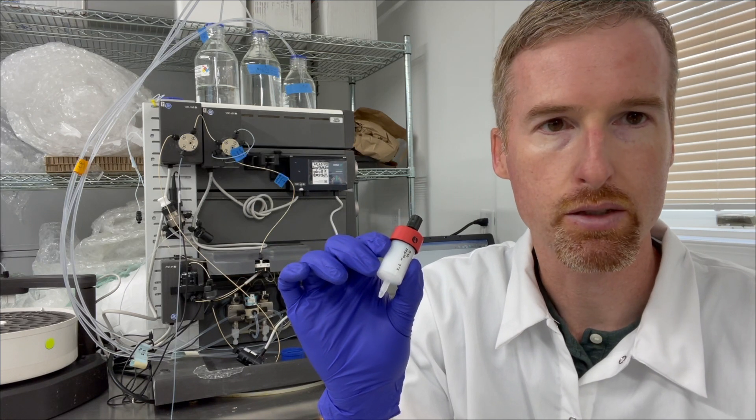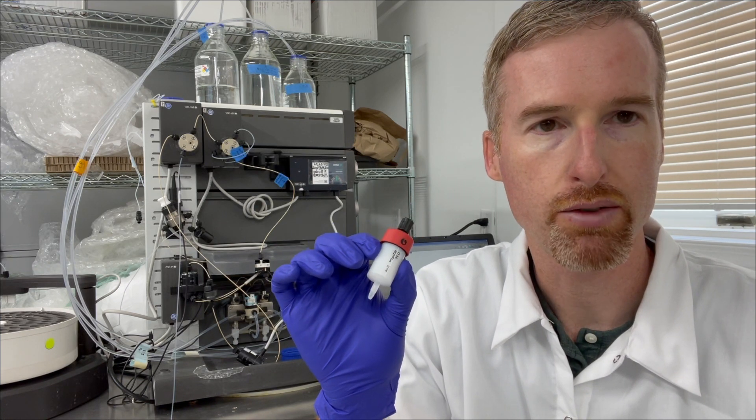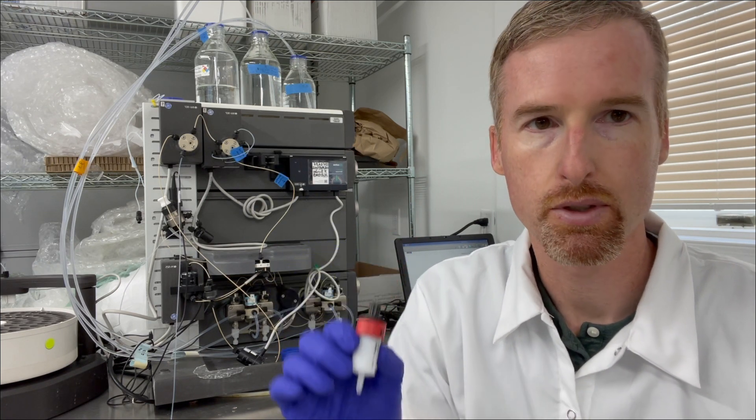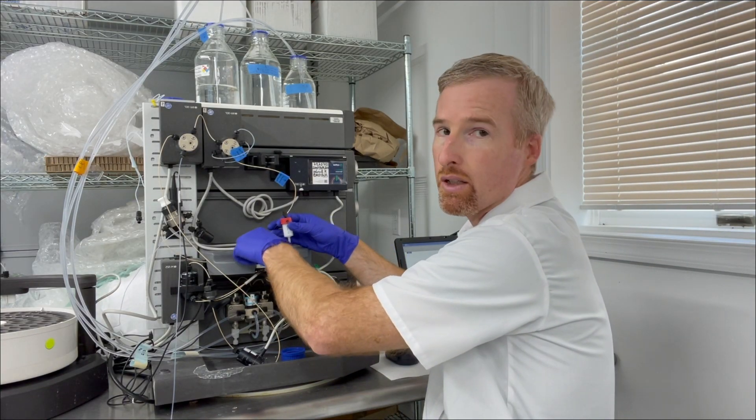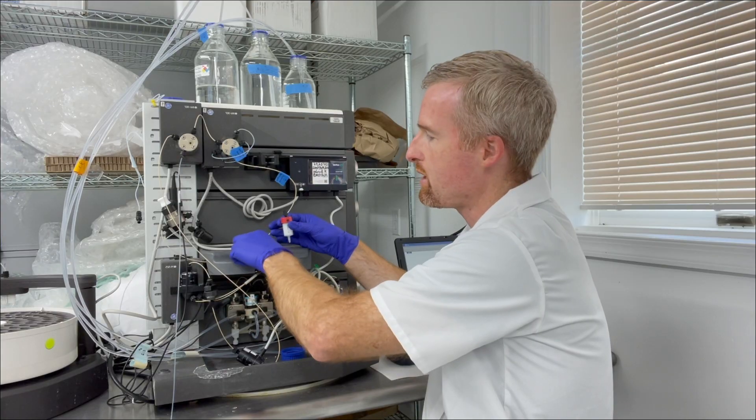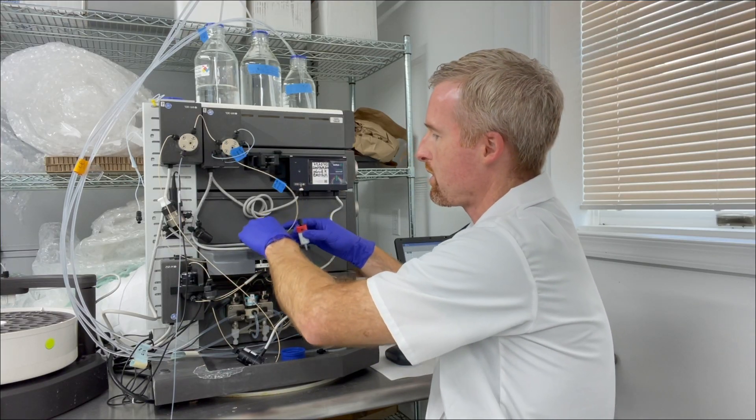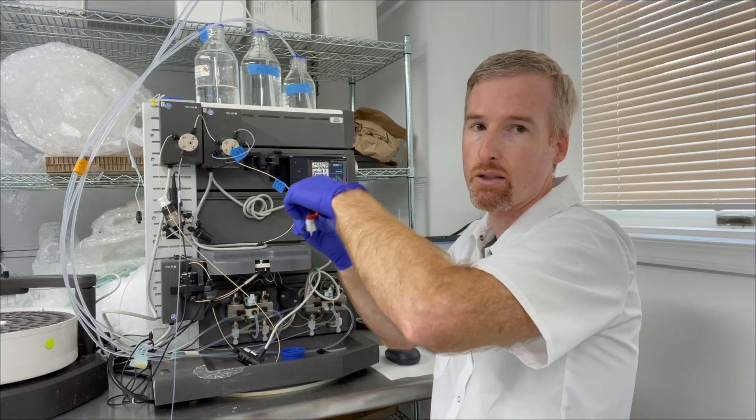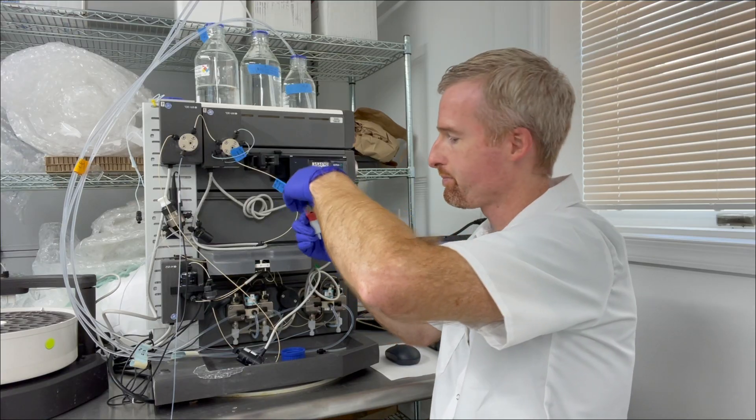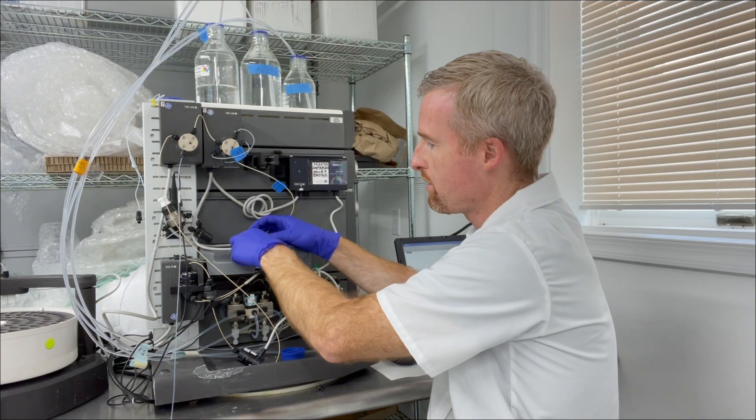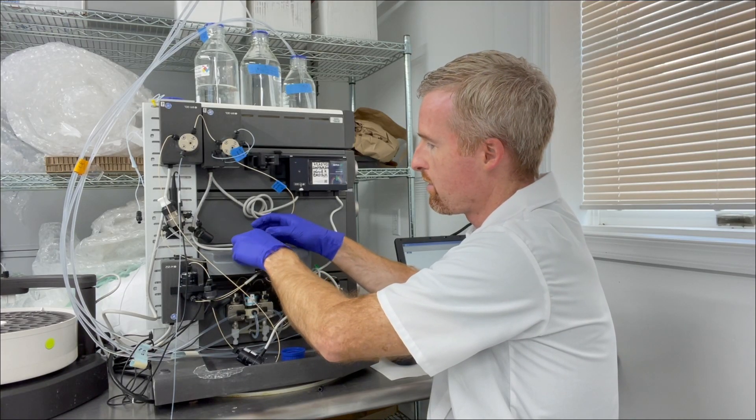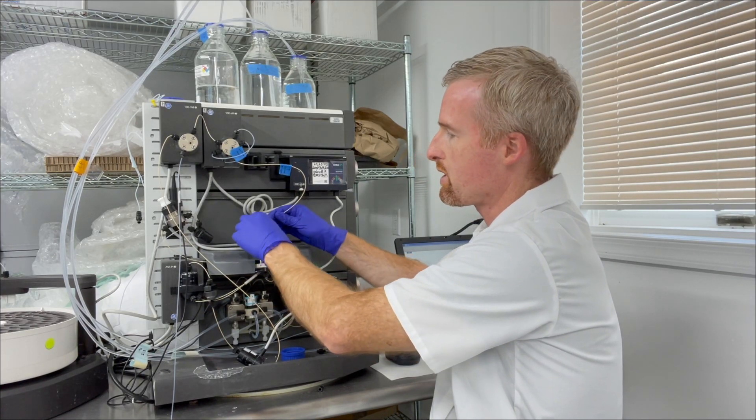So I'm going to use the FPLC to pump buffer A into the column. In order to do that I'm just going to hook it up right here above the UV detector. So I'll unhook that, take the plug out of the top of the column, I'll screw it into the UV detector here. Get it just finger tight.